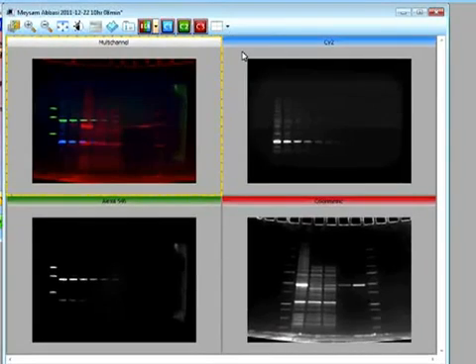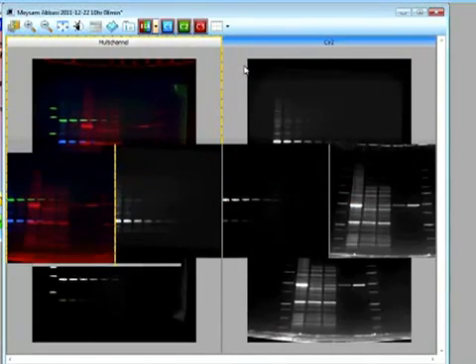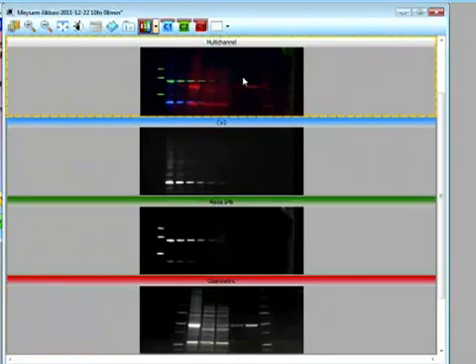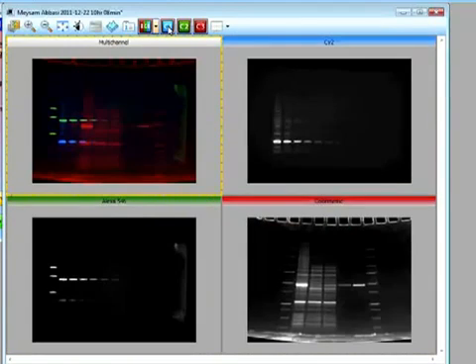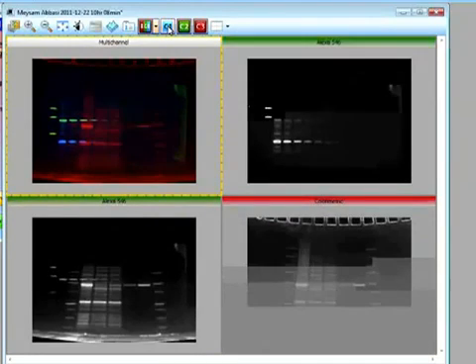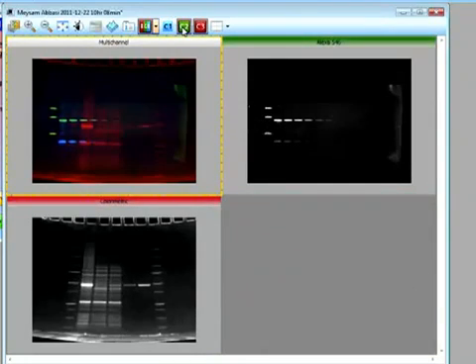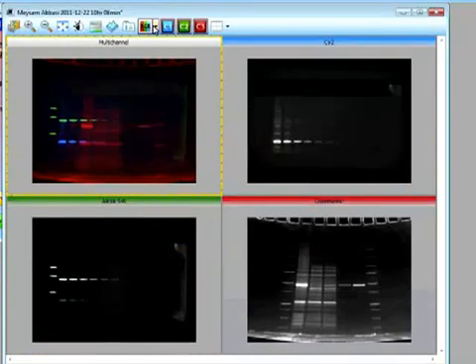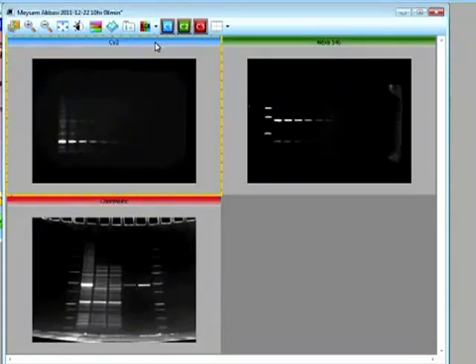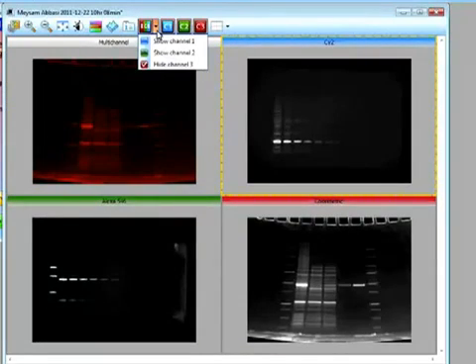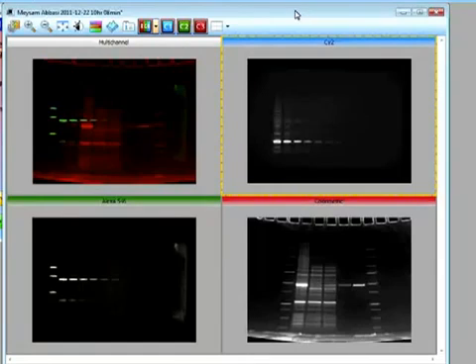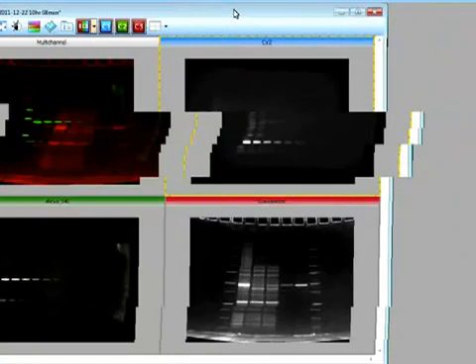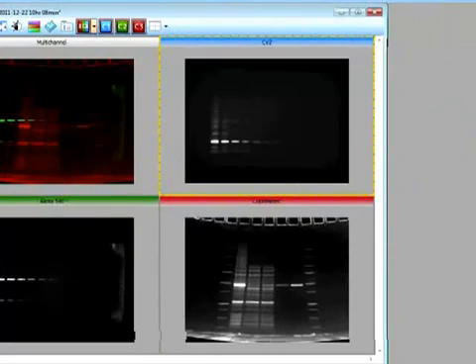And we can select to look at the grid view, vertical view, horizontal view, or single view. And in the full image, we can select to hide a specific channel if you wanted to. And in the multi-channel image, I can select to hide either of the channels to look at one or two specific channels. So this is how easy it is to take an image for multi-channel protocols.